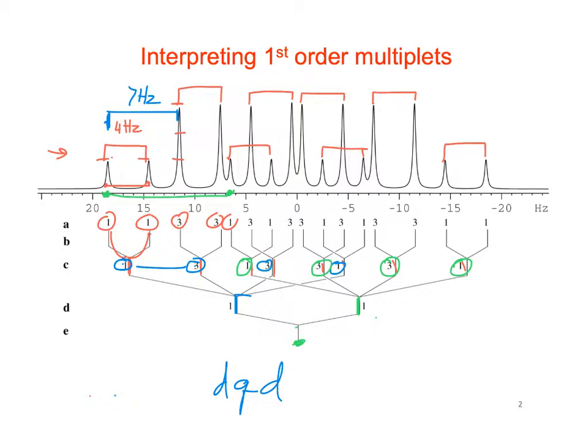So this is another place where, I guess I could do this with this, if my paper is big enough here. It's not really big enough all the way there. But for maybe this quartet component, I could make a mark here and a mark here, and then I can slide it across and so I see, oh, those match, right? Those match, those match, those match. And so you should find those coupling constants should match all the way across.